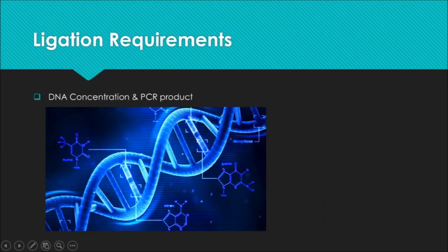Ligation involves joining the ends of DNA with other ends. However, each DNA fragment has two ends, and if the ends are compatible, a DNA molecule can circularize by joining its own ends. At high DNA concentration, there is a greater chance of forming intermolecular ligation, while at lower DNA concentration, the intramolecular reaction that circularizes the DNA is more likely. The transformation efficiency of linear DNA is much lower than circular DNA, and for the DNA to circularize, the DNA concentration should not be too high. As a general rule, the total DNA concentration should be less than 10 micrograms per milliliter.